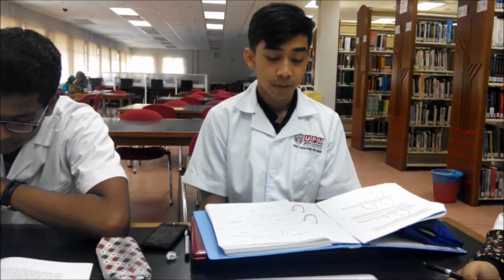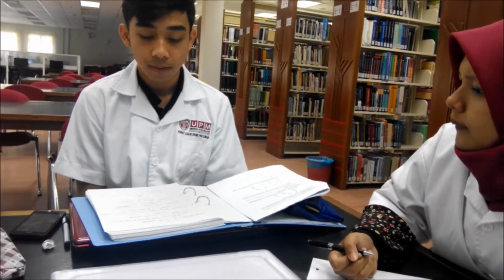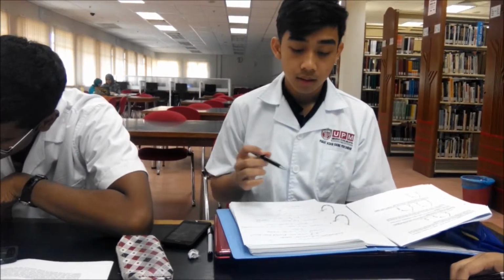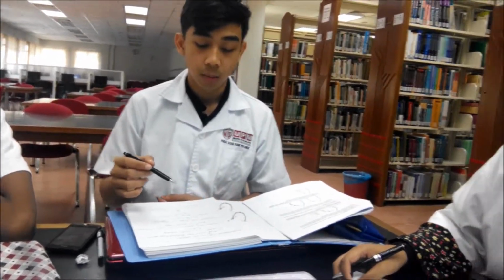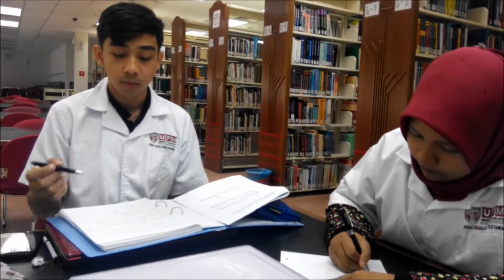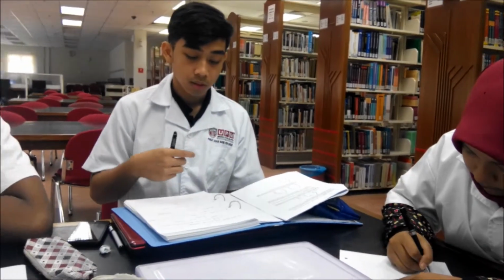I will continue from my friend before. So the next step is we have to micropipette 500 microliters of buffer solution into the 15 milliliter conical tube which is labeled control, and then another 500 microliters from the control tube into a cuvette, and then the cuvette is labeled start. This is the control.